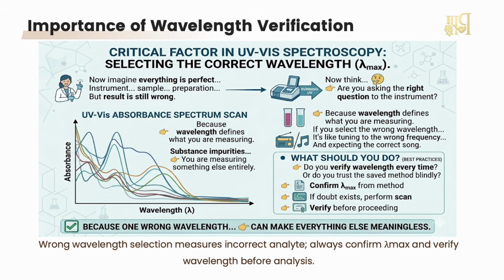Now let me ask you, do you verify wavelength every time? Or do you trust the saved method blindly? So what should you do? Confirm the lambda max from method. If doubt exists, perform a scan. Verify before proceeding, because one wrong wavelength can make everything else meaningless.